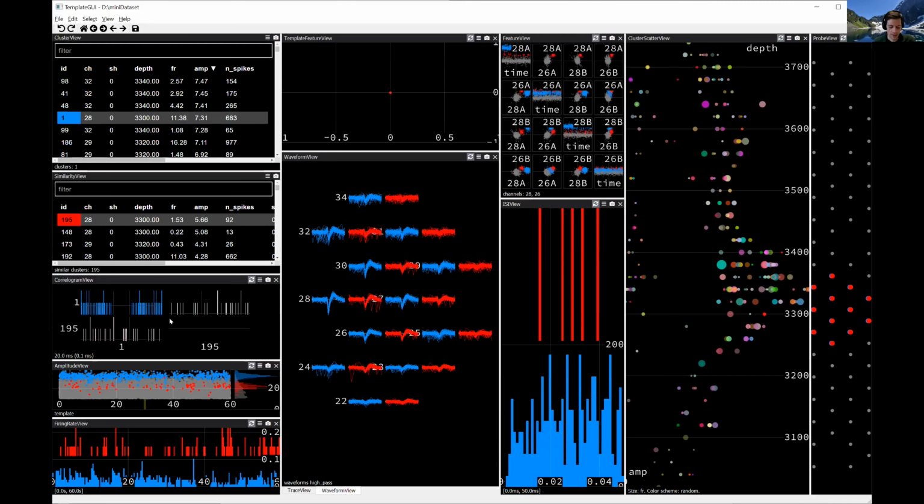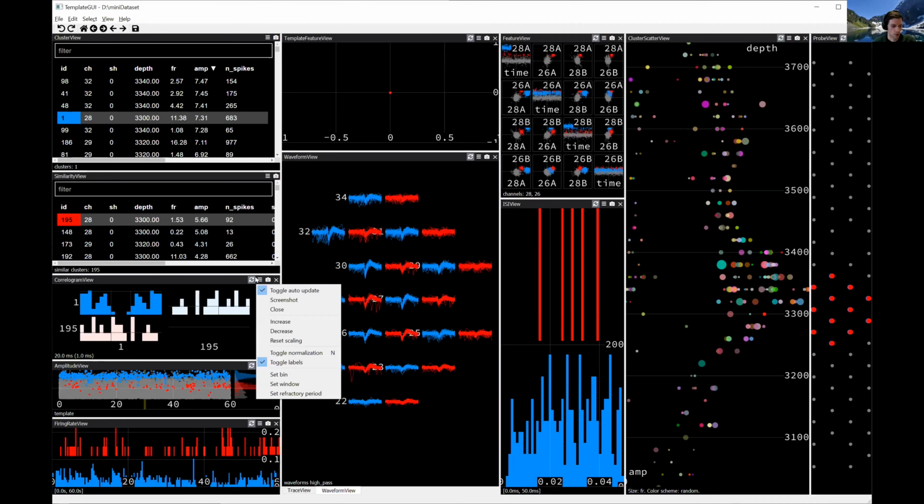The way you use those alias commands is by typing a colon. And if I type a colon, then I get a little prompt down here in the lower left. So in the bottom left, you probably can barely see it, but it says colon and then a little cursor. And now I can type a command. So CB is the alias for Correlogram bin size. And I can type a value 1, and my Correlogram bin size went back to a bin size of 1. And so again, you're just figuring out what those commands are by these aliases to hover over.